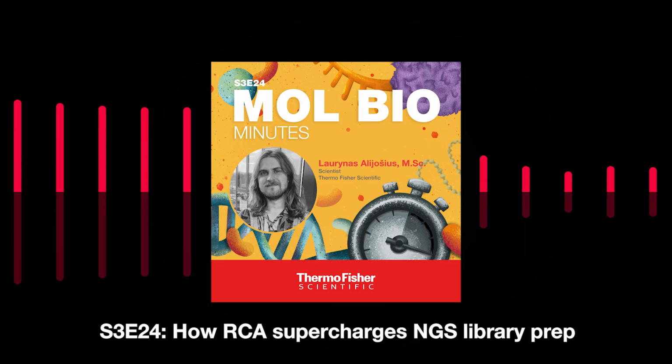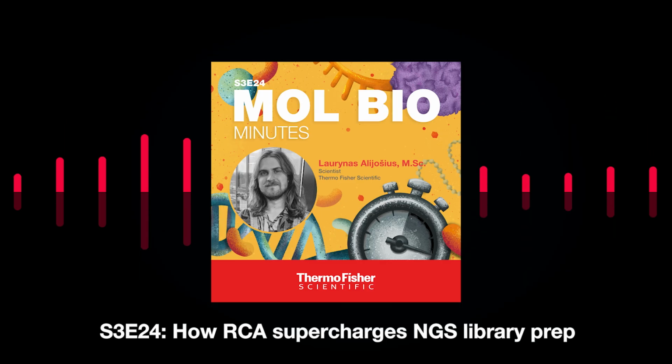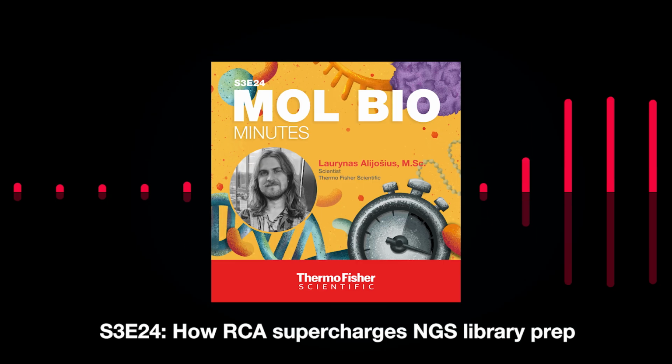Our friend and colleague Laurynas Alijošius is back again today, this time with insights on RCA, rolling circle amplification, and its use with next-gen sequencing.